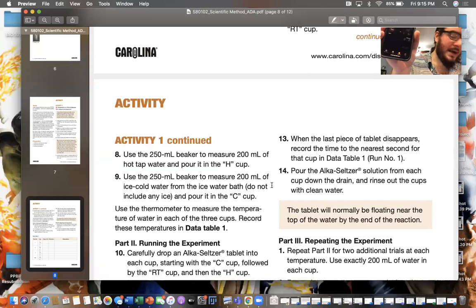All right, and we're out. We're at about 20 seconds. All right, so remember our room temperature was at 46 seconds. That's a pretty big difference. And for observations, I'm writing louder fizzing, right? Because it just sounded louder. So again, now you can dump your hot water. All right, and we're going to move on to the last one, which is our cold water.